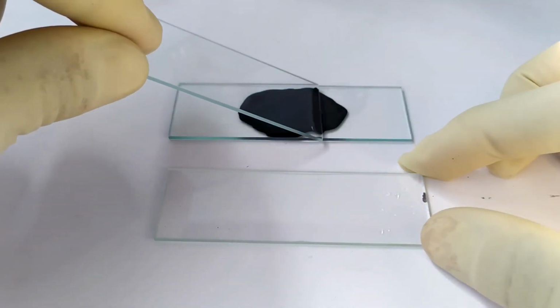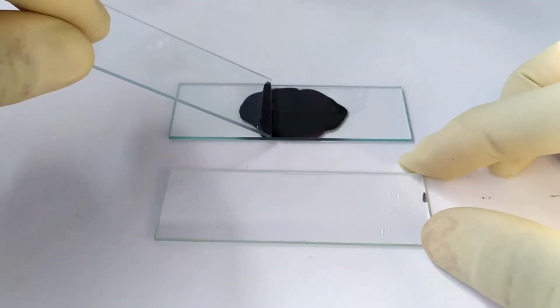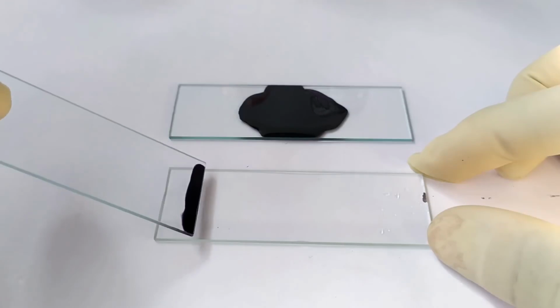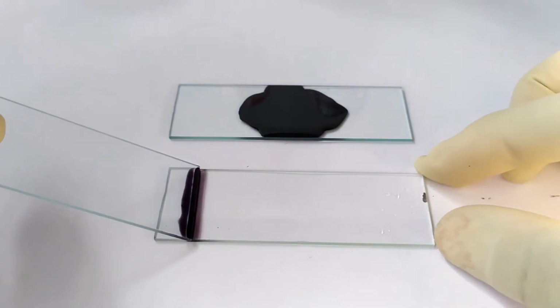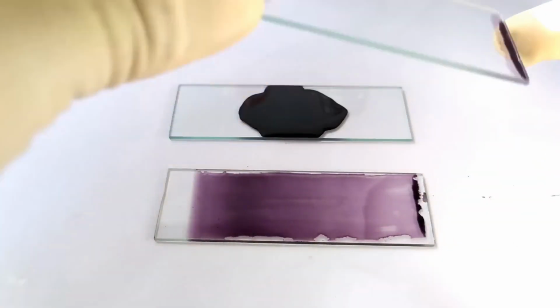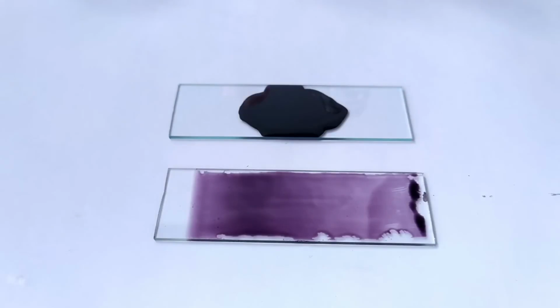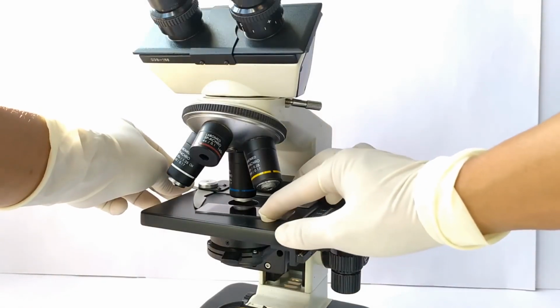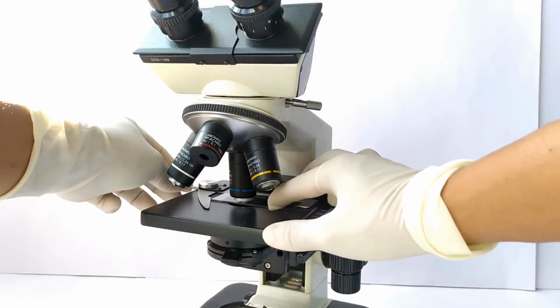Take a second slide, touch one edge of the slide on the sample and prepare a smear of the sample onto a third slide. Allow the smear to air dry. Observe the slide under high power 40x or 100x of the microscope.